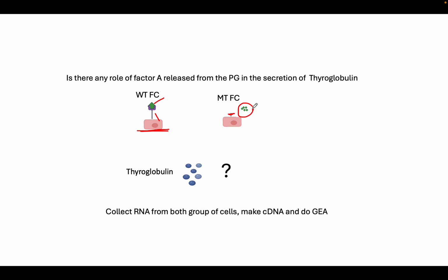Now I am looking at whether these cells are capable of secreting thyroglobulin, which is a protein and a precursor of thyroxine.